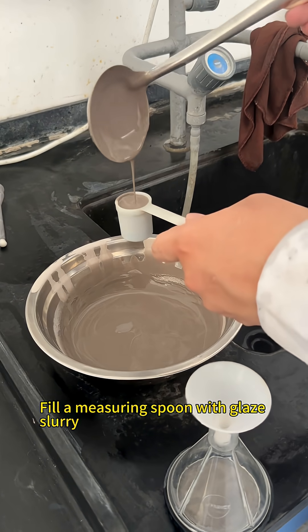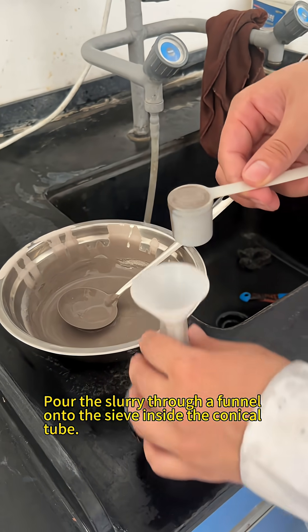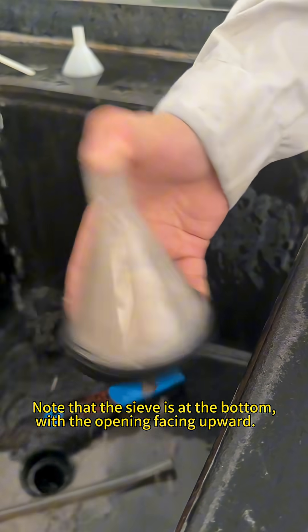Fill a measuring spoon with glazed slurry. Pour the slurry through a funnel onto the sieve inside the conical tube. Note that the sieve is at the bottom with the opening facing upward.